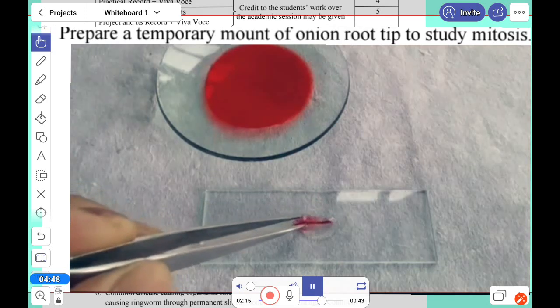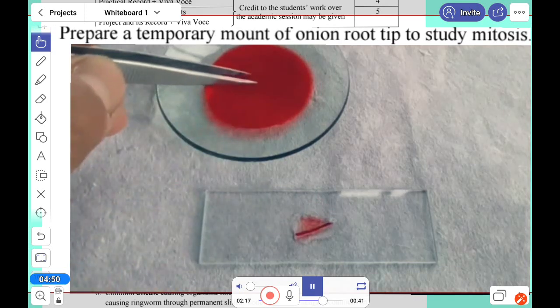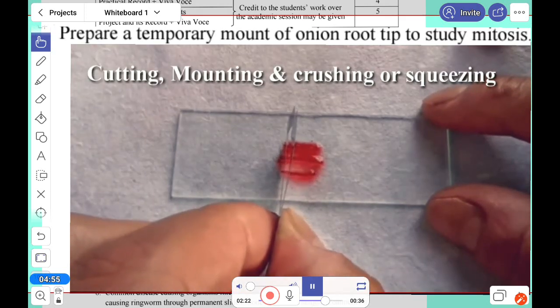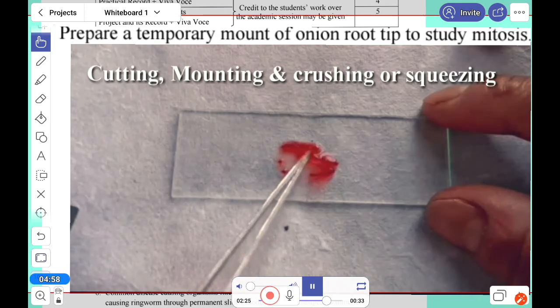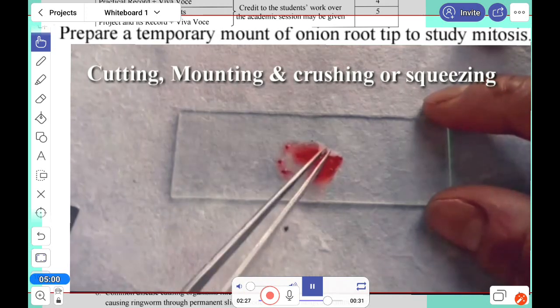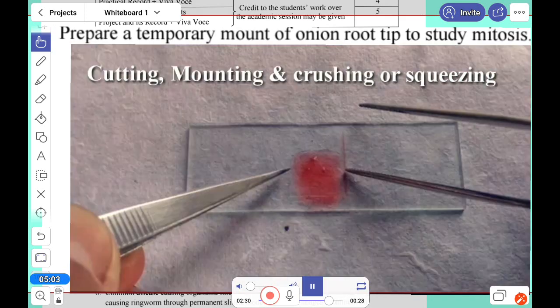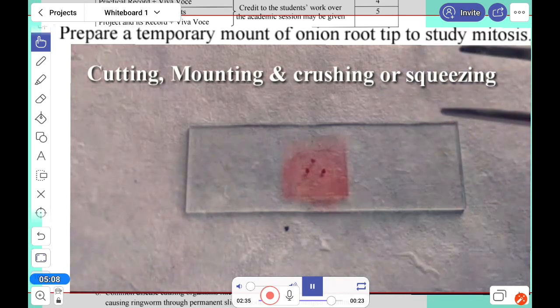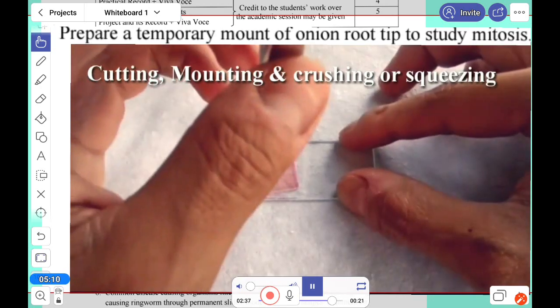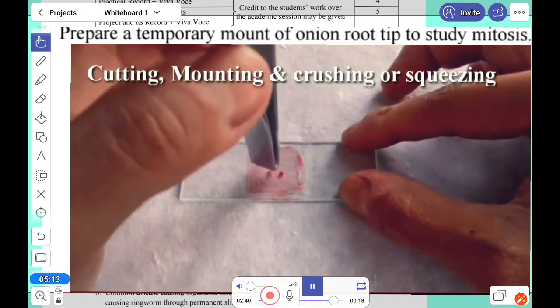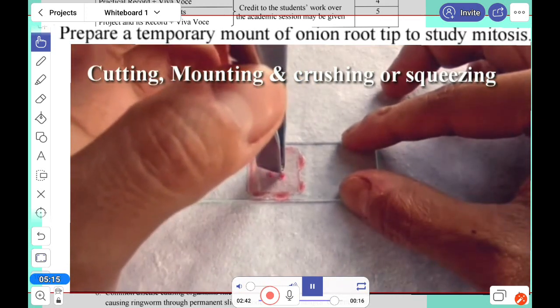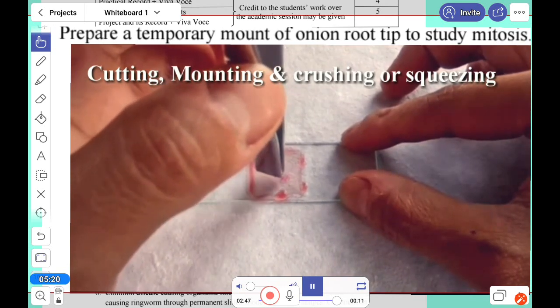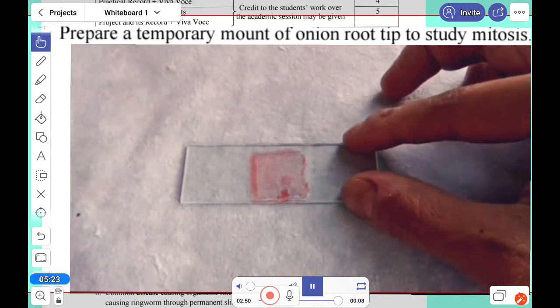After that, this root, the small root, we'll take it, and with the help of a blade we'll cut it into small pieces. Large pieces we'll reject or keep for another purpose. Then we'll put a cover slip. After that, one thing we have to do with the blunt end: we'll crush or squeeze the cells before watching under the microscope.